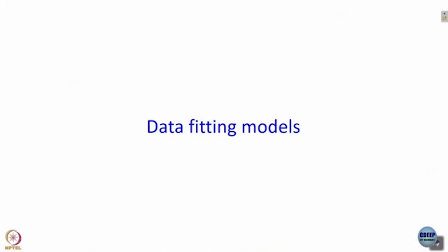But the question is, computer does not have eyes. How does the computer know whether a fit is good or otherwise? But before we go there, let us discuss the data fitting models. Because after all, if you remember, we had said that in the simplest case scenario, we have a single exponential decay, and we said that in more complicated scenario, the most popular way of fitting data, not necessarily always the correct way of fitting data, is by a multi-exponential function.